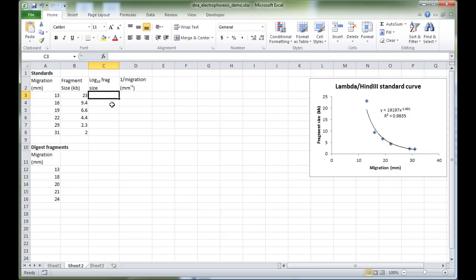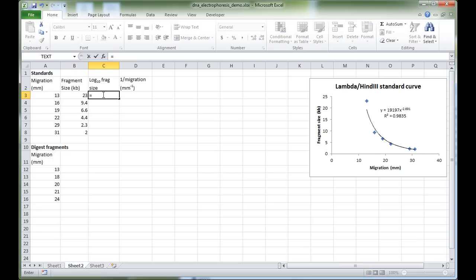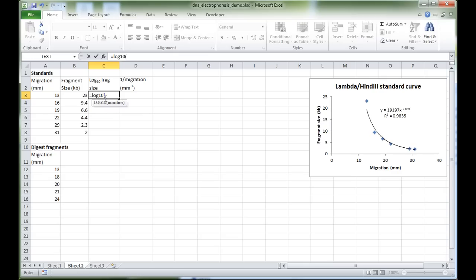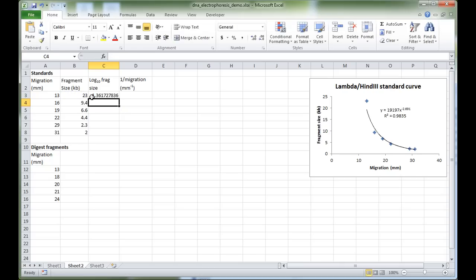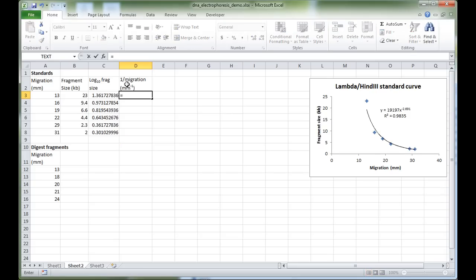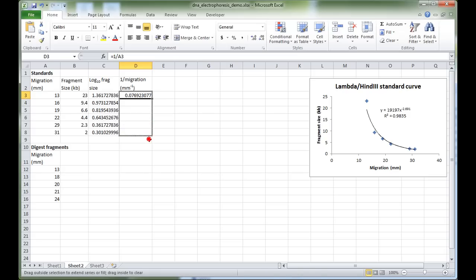To calculate the log₁₀ fragment size, Excel has a handy function: type '=LOG10(' and it asks for a number — use the fragment size in the corresponding cell (e.g., 23 in V3). Press Enter, then click and drag down to propagate the function. For the inverse migration, it's simply '=1/' divided by the migration value. Press Enter and drag that all the way down.